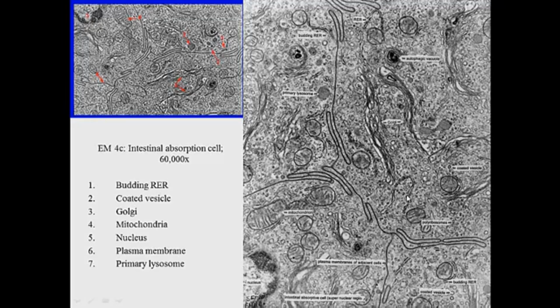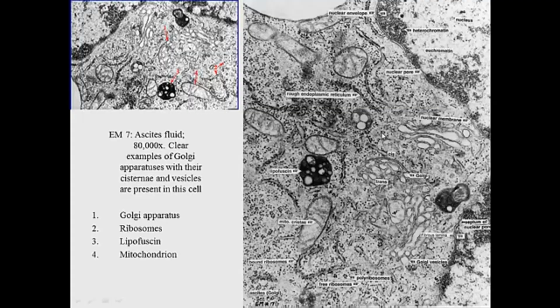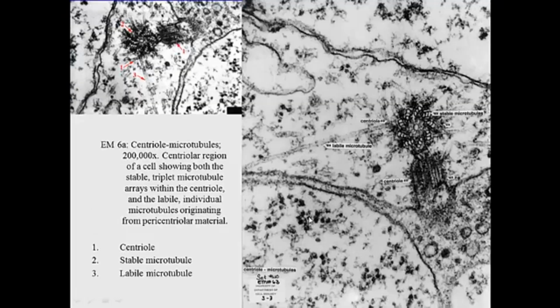This is the endoplasmic reticulum. There's the Golgi up there, but the mitochondria is more defined. Same magnification, we can see microtubules, microfilaments. But we can see the mitochondria, and here are the ribosomes, the polyribosomes, in through there. If you jump to 80,000, ribosomes are quite a bit bigger, and so the mitochondria are larger as well.